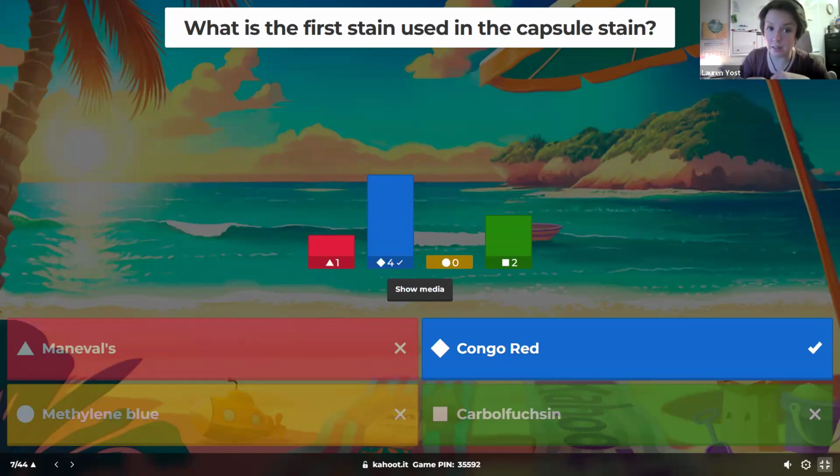And if you looked at the slides that I provided, that I told everybody to look at, everybody's slides, everybody's tables, so you can see what it looks like. We had two tables with endospores. One of them had the little bubbles, and one of them had clear, pill-shaped guys. But they're very clearly a different aspect of what's going on based on the regular red cells around them. You have to be able to recognize that.